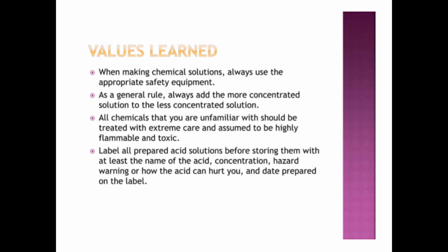And that is why your nose mask, your hand glove, your laboratory coat, your eyeglasses and everything must be available. Then whatever you have prepared and transferred to a reagent bottle, ensure that you label all your prepared acid and base before storing them, with at least the name, the concentration, the hazard warning, or how the acid can hurt you, and the date prepared.